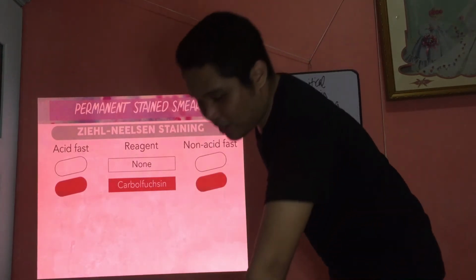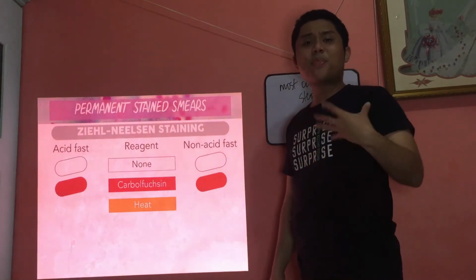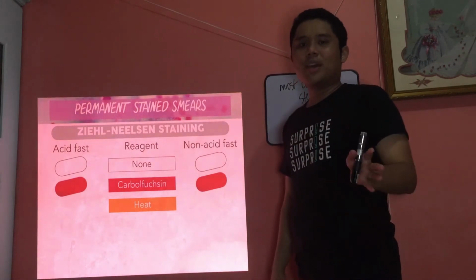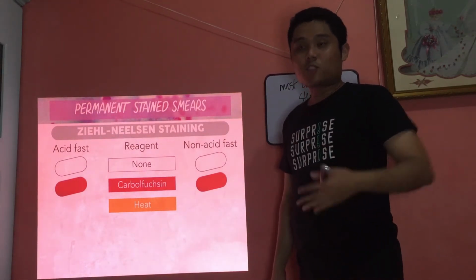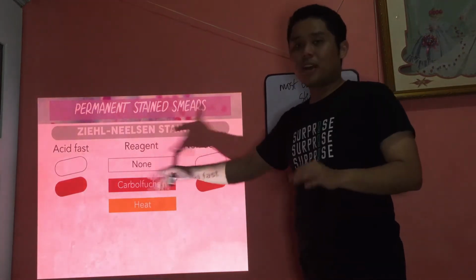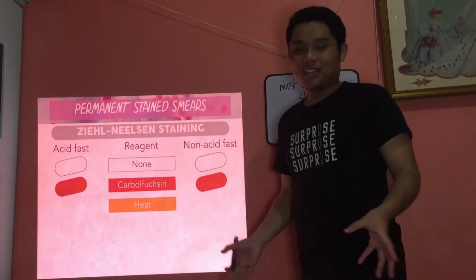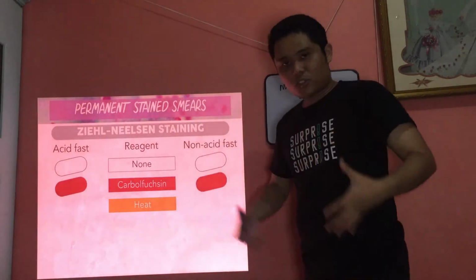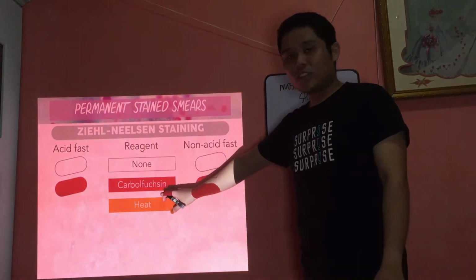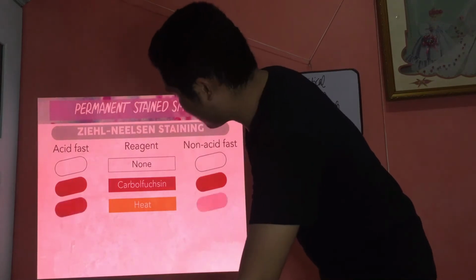Okay. Now, next reagent, your heat as mordant. Now, what's the purpose lang sa mordant? Just to strengthen the relationship between the carbofuchsin and the organism. Just to strengthen. So, do you think there will be a change in color? Strengthen lang man? Of course, wala. Because again, non-acid-fast, acid-fast, still the same. Both red. Why? Wala pa may decolorizer na gibutang. Diba? So, again, mordant just to strengthen the initial relationship between the carbofuchsin reagent, your primary stain, and the organism. So therefore, the color is still the same.